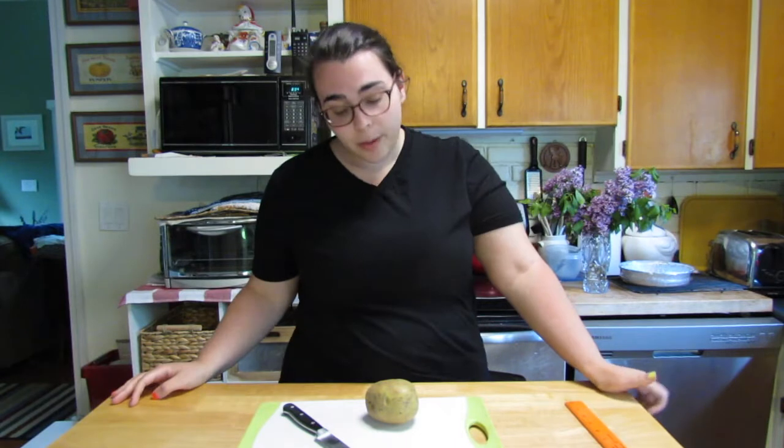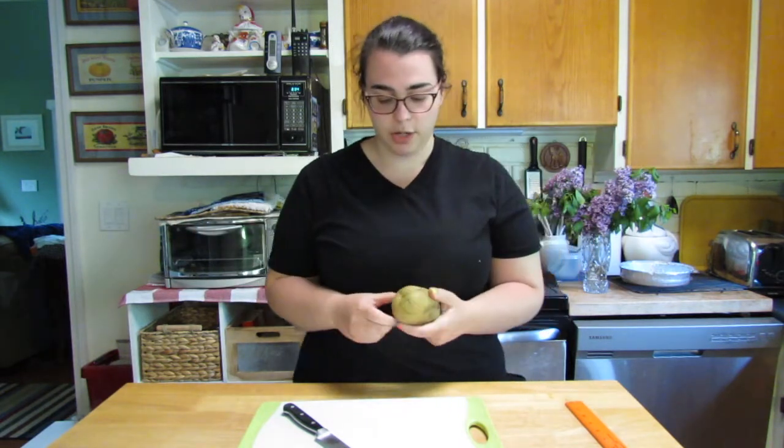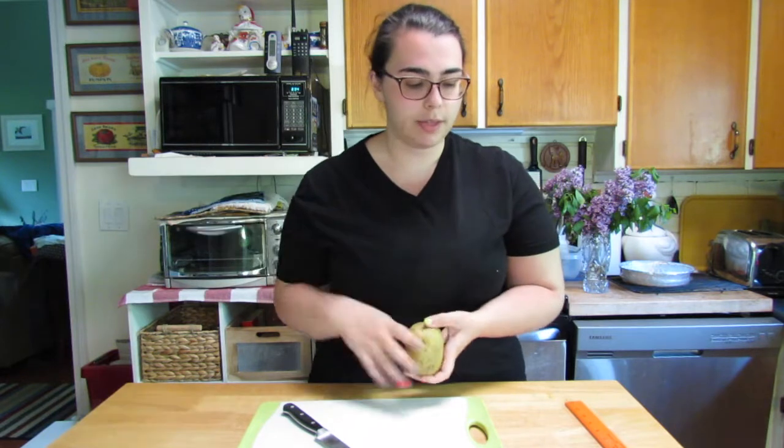So for today's lab, we're actually going to do microbiology the old, old-fashioned way and see if we can get a colony of bacteria growing on a potato slice so we can study the bacteria that we might find in our homes. The first thing I'm going to do is try to get as round a slice as possible. I'm going to do a few slices so I can take a few different samples.